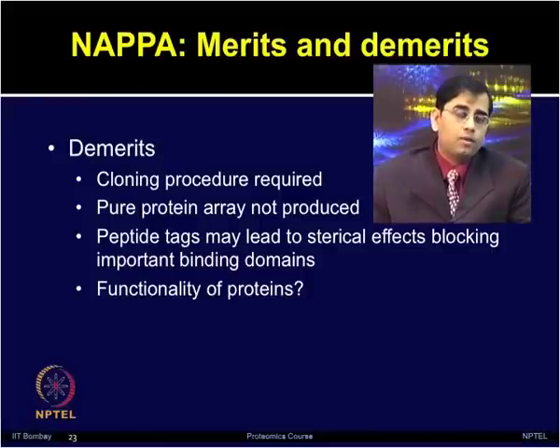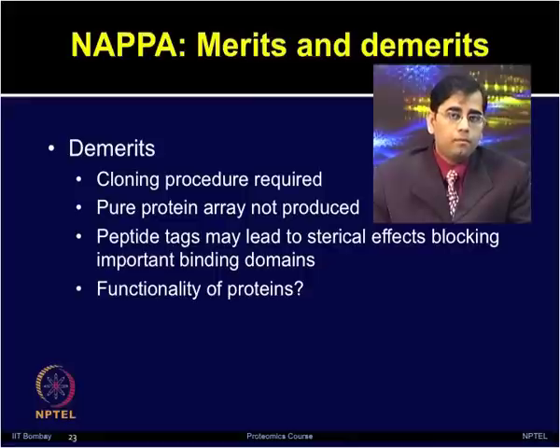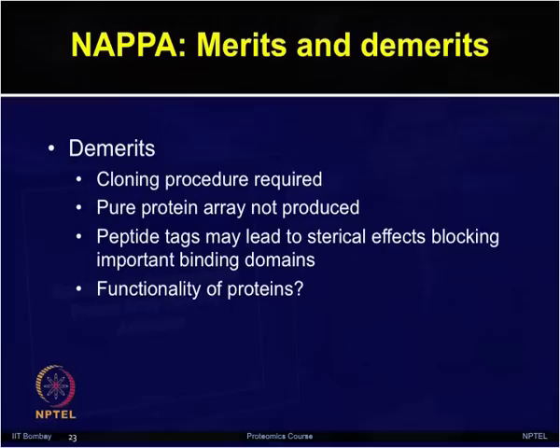The peptide tags which are added for the capturing procedure may lead to steric effects, blocking regions which could be important for binding domains. And functionality of proteins always remains a question for any of these cell-free expression based methods.